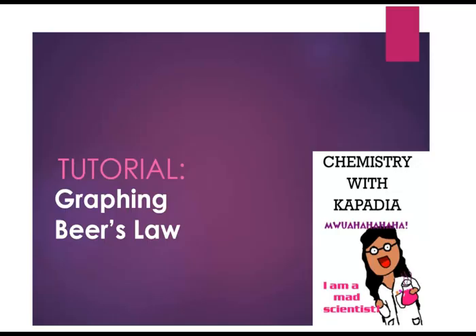Today I will be doing a tutorial on how to graph Beer's law. So our Beer's law plot is an absorbance versus concentration graph. I'm going to show you how to do that in Google Sheets.